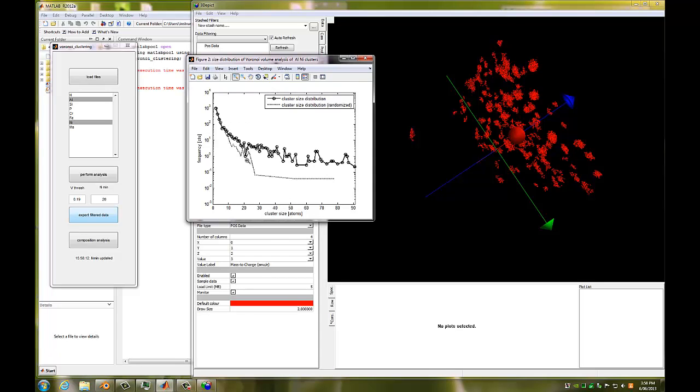So if you look here, that's really where it ends. So maybe 25. Okay, we should probably do it correctly. So it bottoms out here. So we should take this value as the min value, and it would be 23. So we'll go with 23, and there we go.